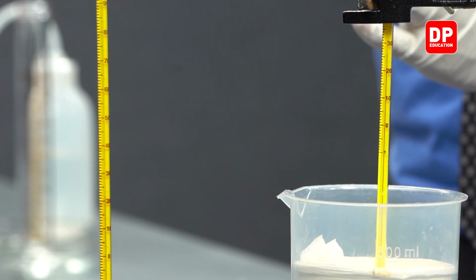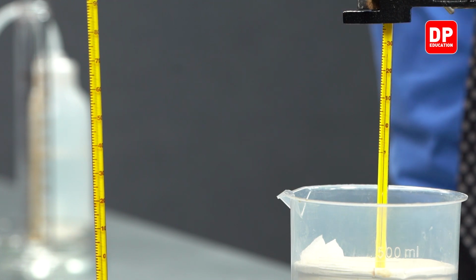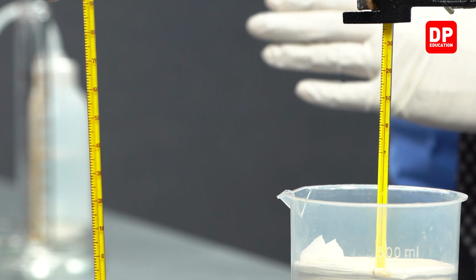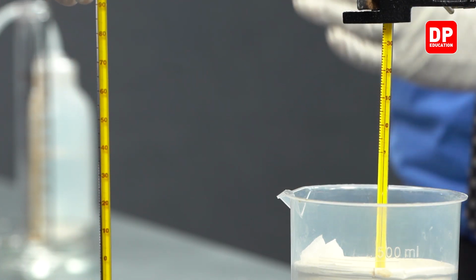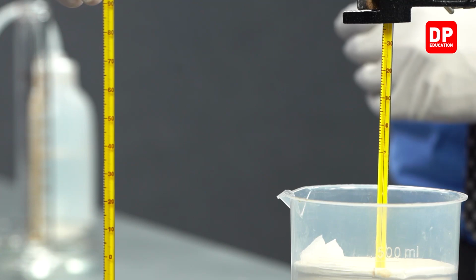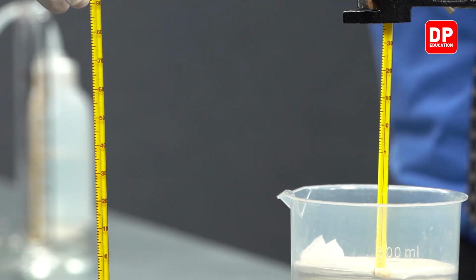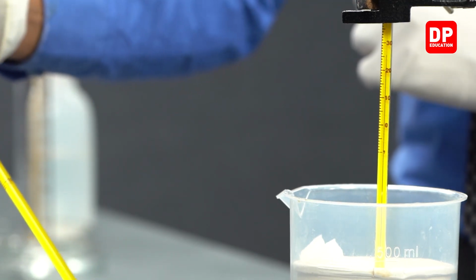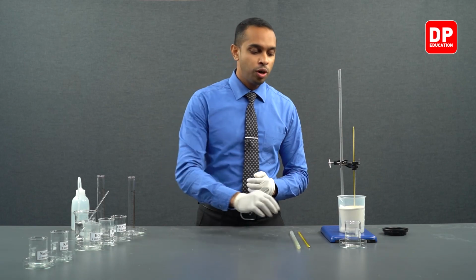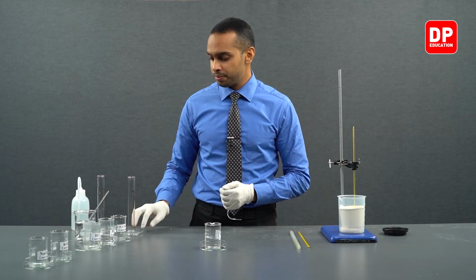Now you can see the two temperatures here. On the left hand side, we have the temperature of our acetic acid solution, which is 26 degrees Celsius, and on the right hand side, we have the temperature of the ammonium hydroxide solution, which is 22 degrees Celsius. Now let's move on to measuring 50 milliliters of our ammonium hydroxide solution.